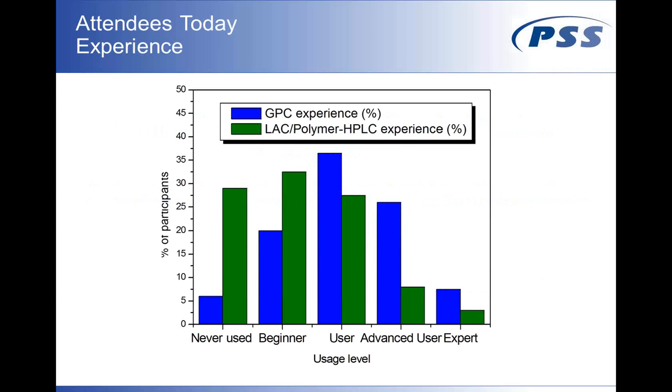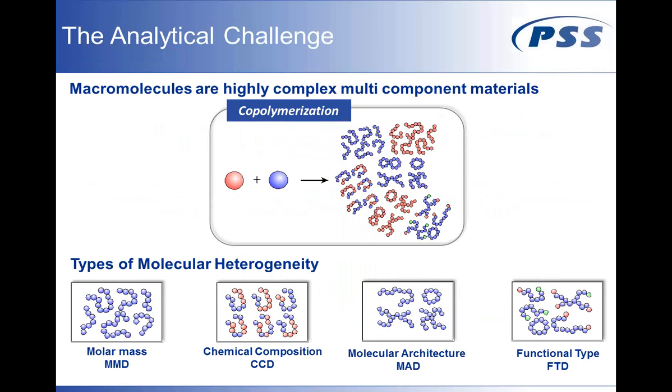Just as an introduction, we asked you in advance in a short survey how much experience you have with chromatography of polymers, and that is the result that we have. Most of you have some experience with size exclusion or gel permeation chromatography. However, there are fewer users that have experience with HPLC on polymers, and that is what we are talking about today.